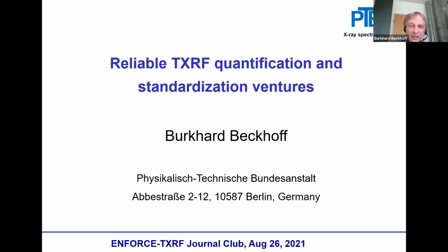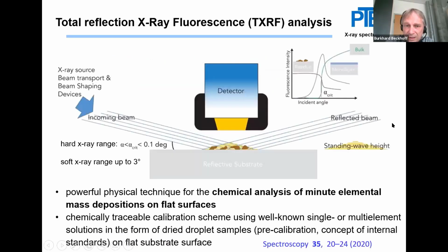than many others, as we have the possibility to use calibrated instrumentation, which I will show you in a moment. But our independent quantification mode has the advantage that it can serve for validation purposes. So, let's see.